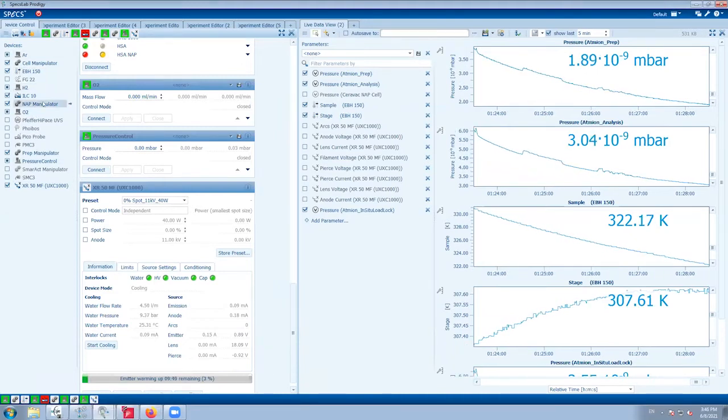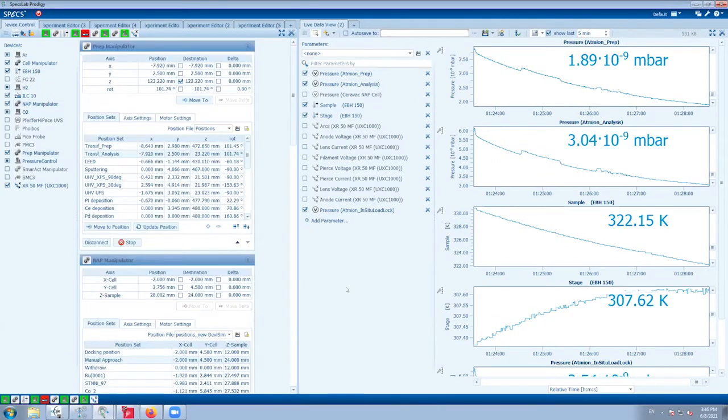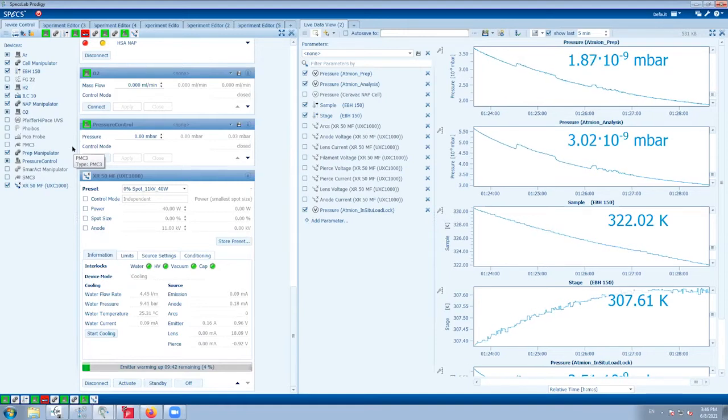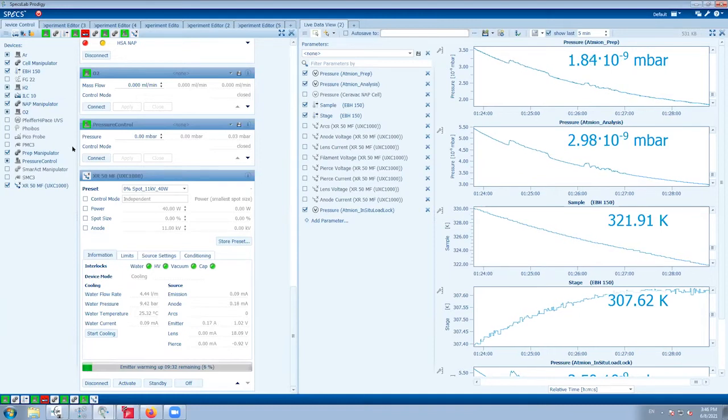You're too busy explaining, so we forgot to start it, but this is the process. Normally we do this in the morning, and then we usually put the X-ray source to standby mode during the measurements, or when there is some kind of heating and we don't measure. So usually you start the X-ray source in the morning and keep it on the whole time, unless you put it in standby mode.